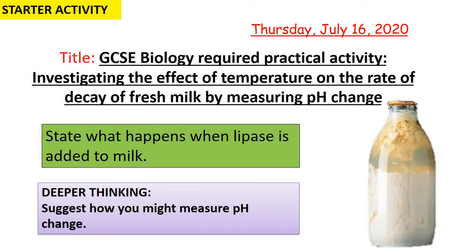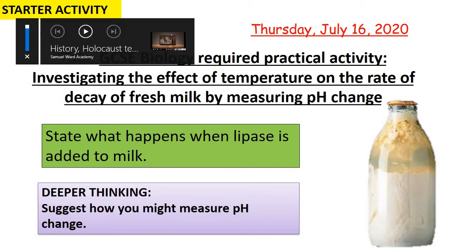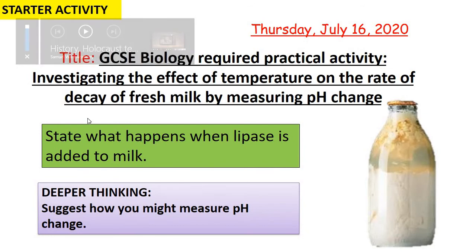So you will have got an investigation planning sheet, which we've used before, and you would have had a go at planning your own practical, and done some research of your own using the internet to then plan that practical. What this video is going to do today is go through the method and make sure that we've got all the finer details of the method. We're going to look at some example results and how we would analyse that, and how we could also do a graph to represent those results as well.